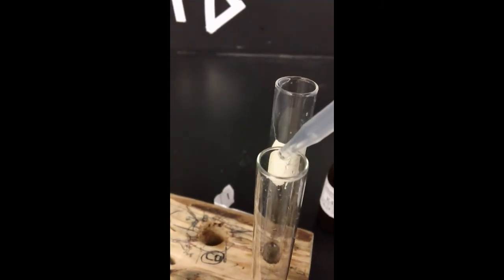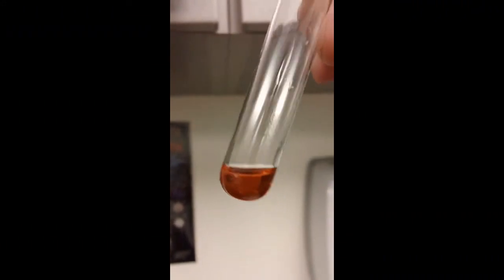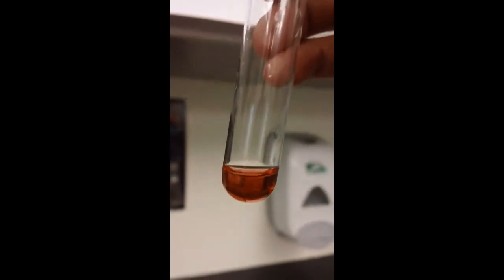Now I need to drop 5 drops of K4FeCN. Let's double check the bottle to the side. Okay, 5 drops of this. Let's see what we got. Ooh, notice what we've got here. Okay, so that is the last step before putting in chemical waste for your unknown for test C.